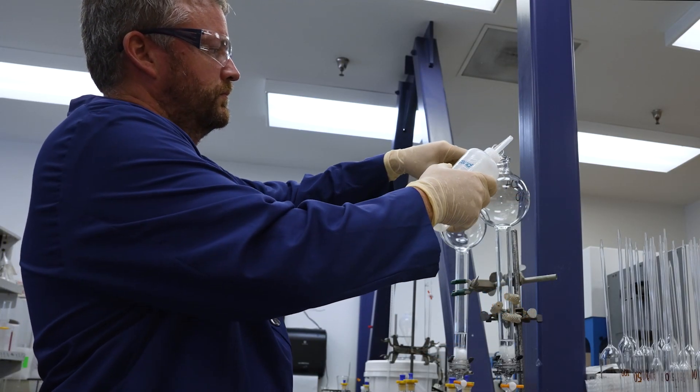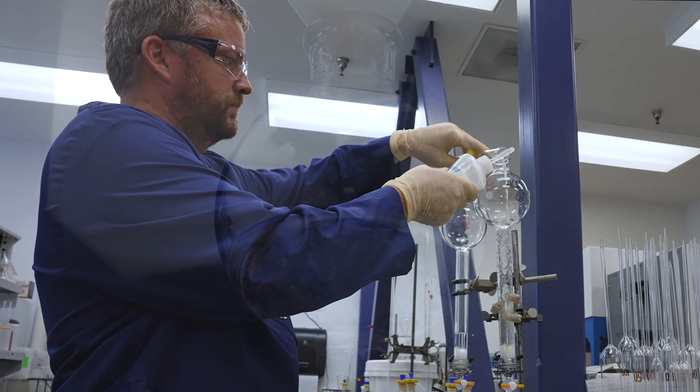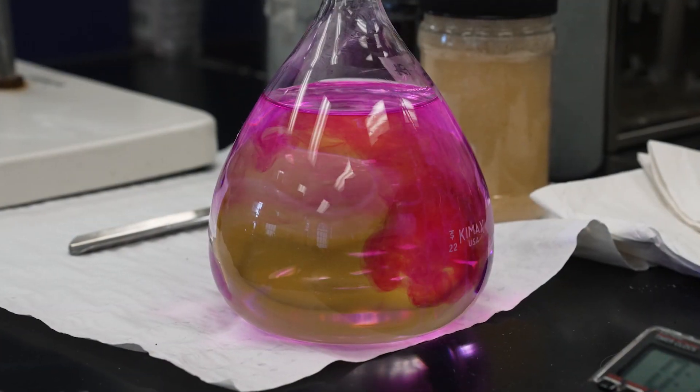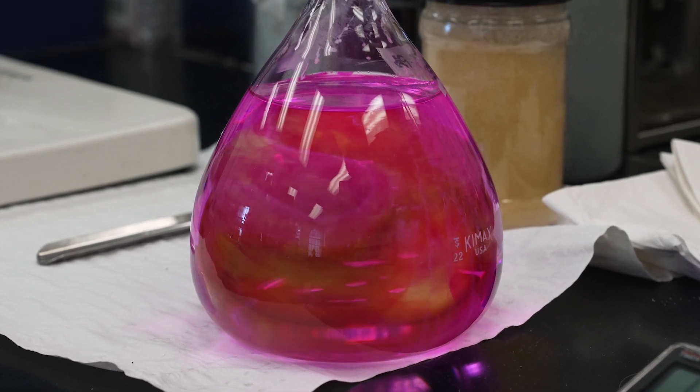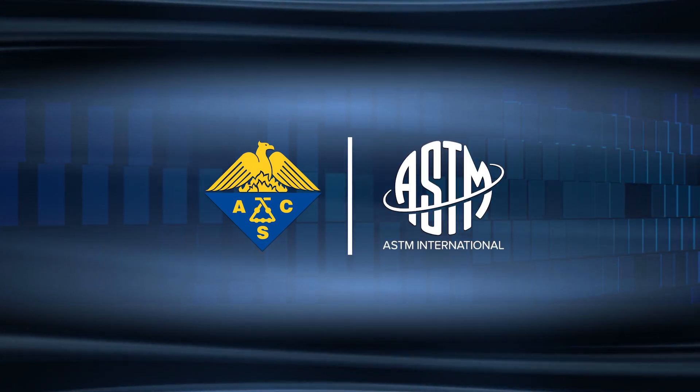NWCIP chemists analyze and certify all chemicals used in the primary and secondary systems aboard naval nuclear vessels. Their main purpose is ensuring these chemicals meet the strict specifications required by the Navy.